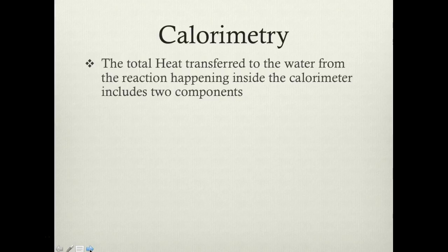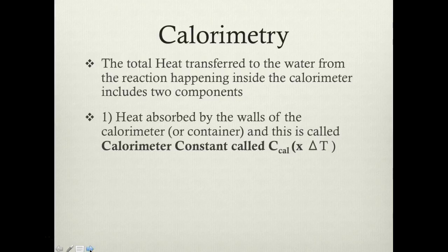So the total heat transferred to the water from the reaction happening inside the calorimeter has two components to it. One component is the heat absorbed by the walls of the calorimeter. So yes, the system is isolated. However, you have to take into consideration that all of the heat is not just absorbed by the water from the heat generated from the reaction, but some of the heat would also be absorbed by the walls of that calorimeter, and this is called the calorimeter constant, abbreviated as Ccal.